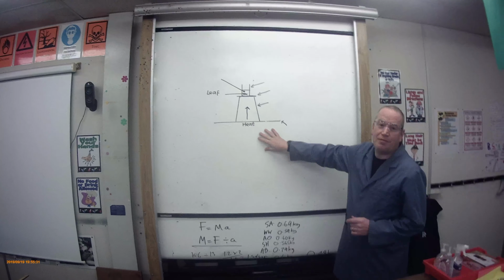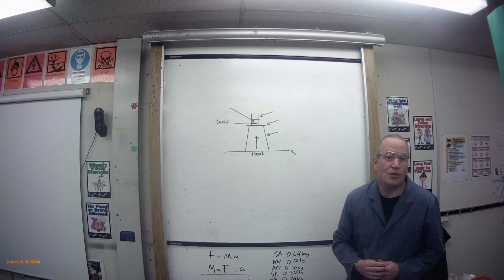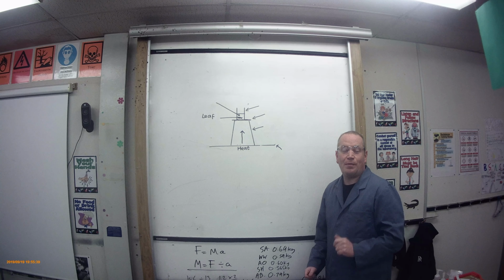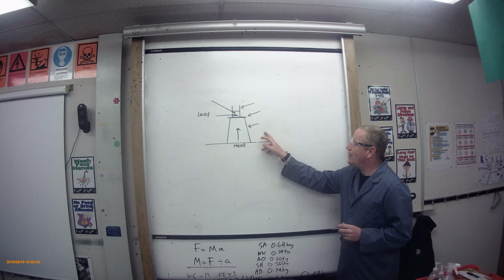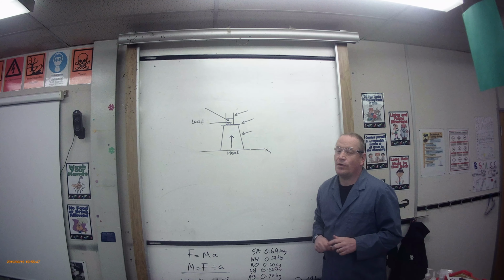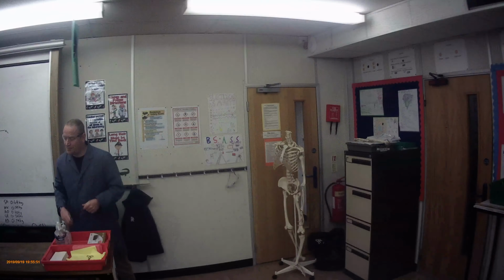It would be very good if in your books you copy this one down, make sure you use 1, a pencil, 2, a ruler. You know how much we hate it when you get that one wrong. So please, pencil and ruler, and then label the pieces missing off the diagram. You should be able to name these pieces of equipment that we use in the lab. I'll just come round and show it. Yes. Clearer. Nice and clear.